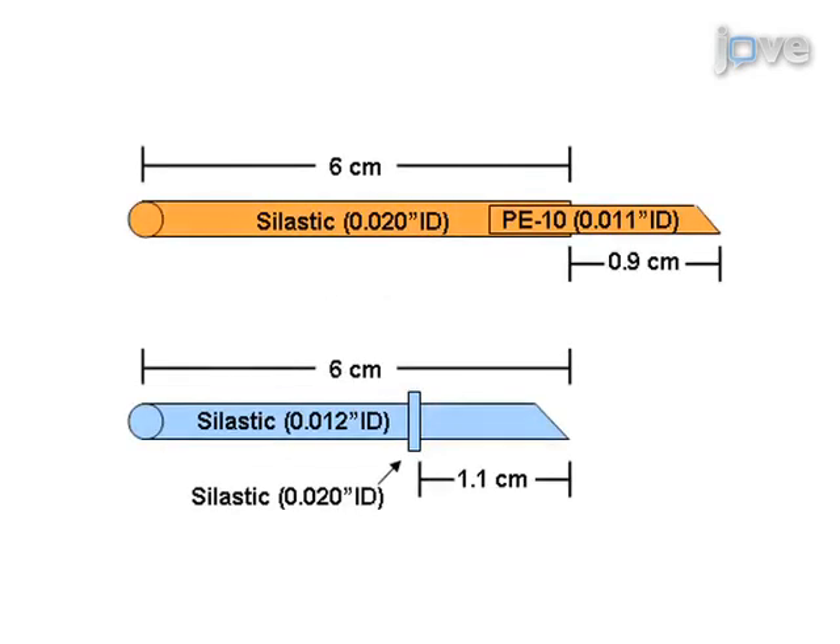The arterial catheter is made by inserting a beveled piece of PE10 tubing into a six centimeter piece of silastic tubing such that the PE10 extends 0.9 centimeters from the silastic. The venous catheter is a collared six centimeter piece of silastic tubing.